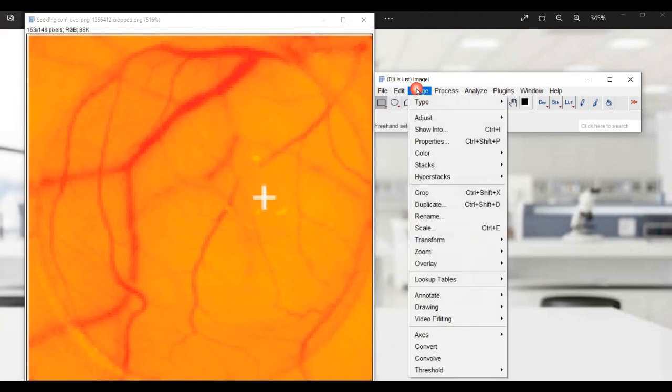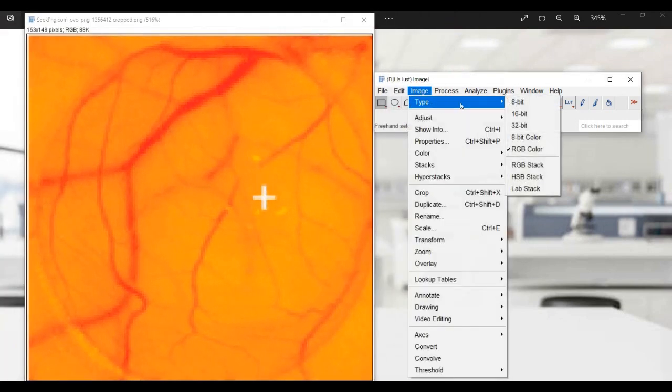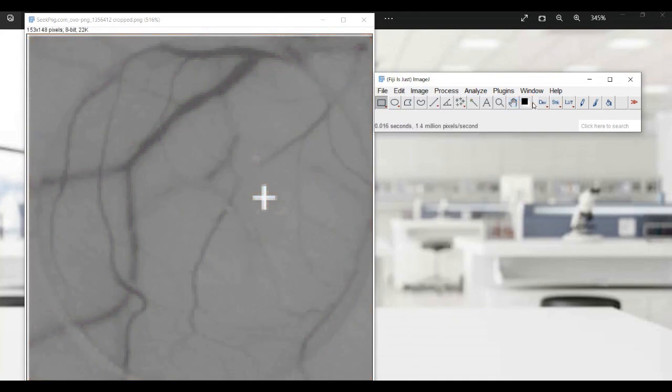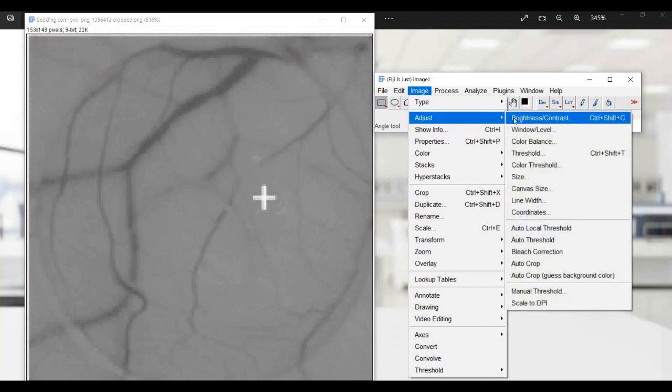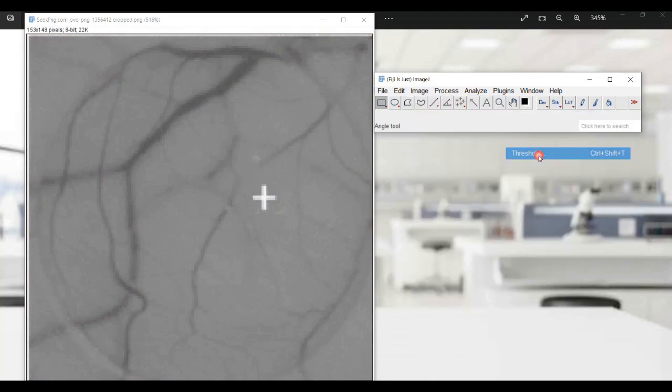This can involve cropping out any irrelevant areas of the image, adjusting the brightness and contrast, and applying any necessary filters to enhance the features you're interested in.